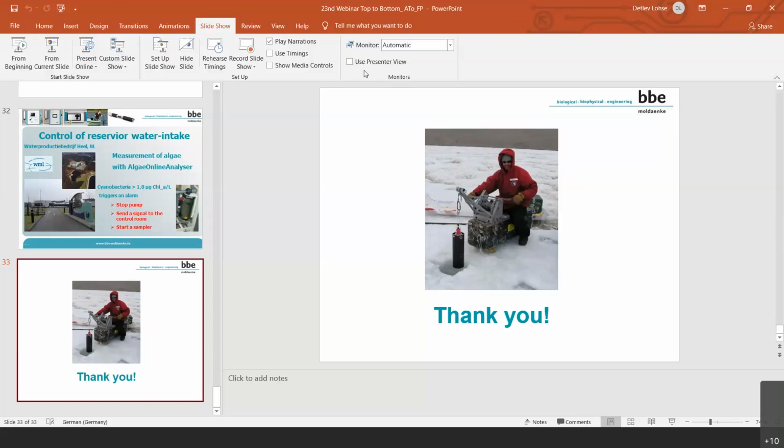Yeah, I got another question. You talked about the FTU to measure the distribution. Sorry, I did not get the beginning of your question. Okay, I will repeat it. I've also put it in the chat box. You have spoken about the turbidity, and that is in the FTU unit. Is it equal to the NTU? Are the FTU and NTU equal to each other, or is there a big difference?